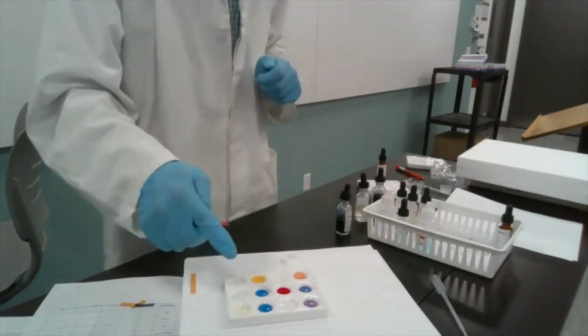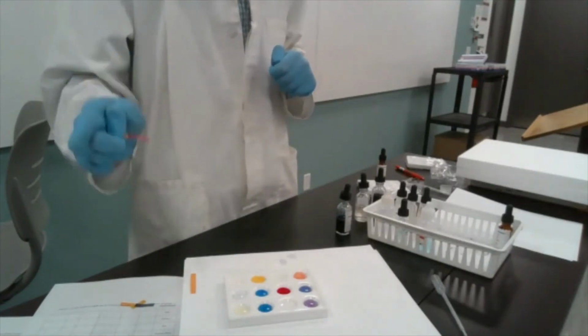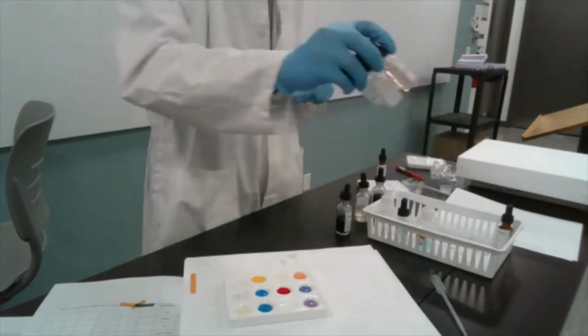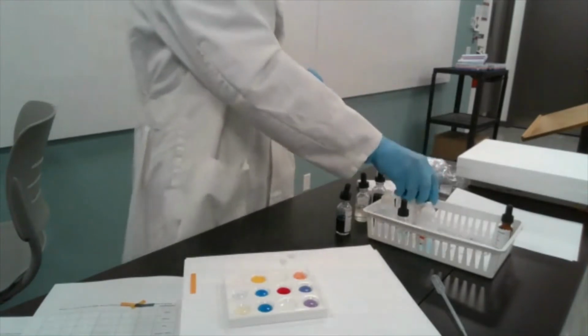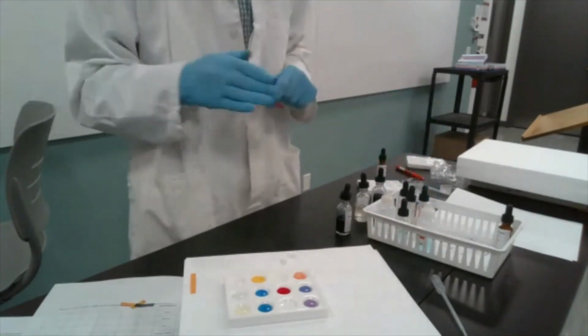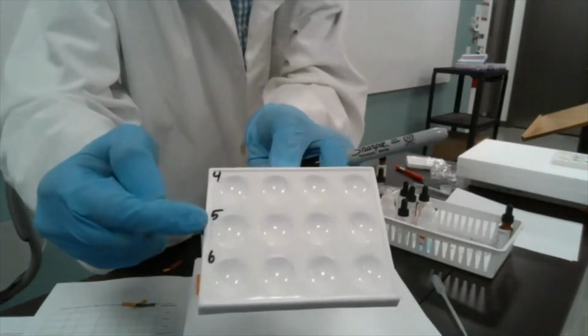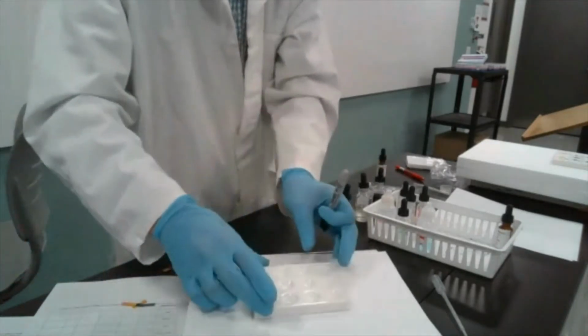Now we can use this knowledge of how each indicator responds to neutral, acidic, and basic solutions, and try to classify some of the household type substances as either acidic, basic, or neutral. So the number 4 grapefruit juice, this is going to be glass cleaner, and then this number 6 soap solution.